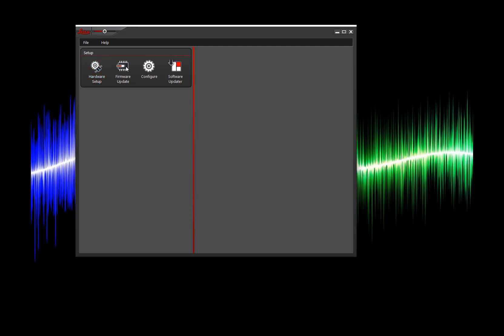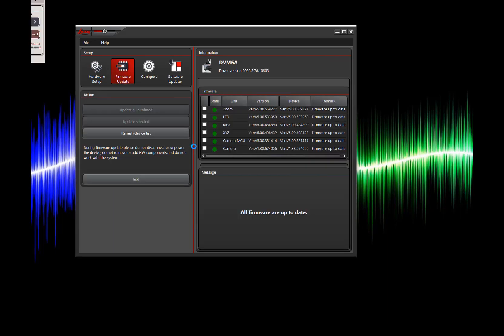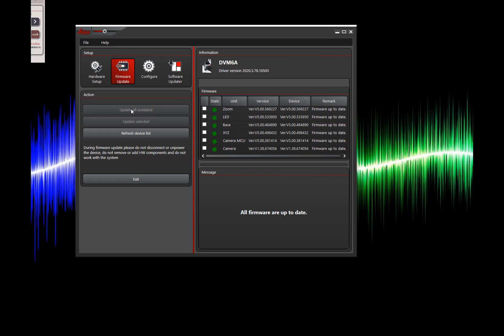From here we're going to go to our firmware updater as I mentioned during the installation process. And we're going to click update all outdated. On this computer all of my firmware has been updated. But you would simply update and these would all turn to green lights when you're completed.